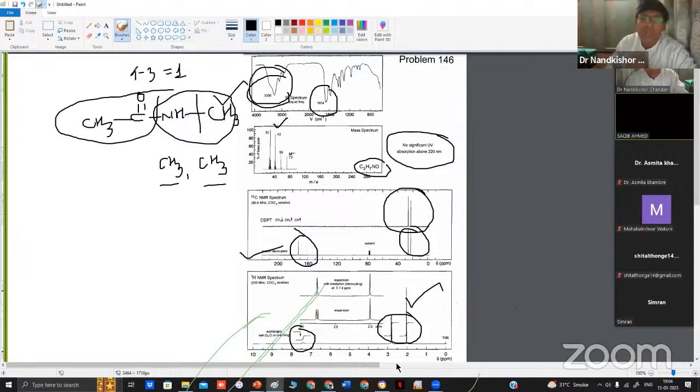I will get the molecular formula support. I will hide the molecular formula and convert that into the elemental analysis. So elements like carbon present, hydrogen present, nitrogen present, oxygen present, halogen present. All those percentages will be given, and from the percentage of the elements, you can easily get the molecular formula.